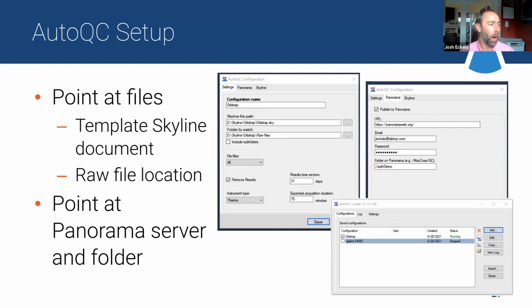And I see some questions too about, does that mean the data is publicly accessible? That's totally up to you. So I think most labs probably keep their system suitability private, and maybe they choose to share it to support a publication or a data set, and maybe they would do the relevant system suitability checks as part of that data sharing. But you have complete control if it's private to your lab, or if it's open to the world, or it can be in between too.